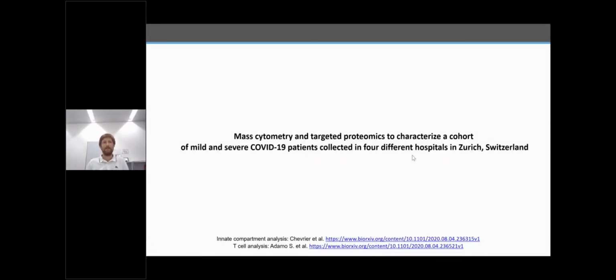And to address this, we performed mass cytometry and targeted proteomic measurements to characterize a cohort of mild and severe COVID-19 patients. And those samples were collected in 4 different hospitals in Zurich, Switzerland.